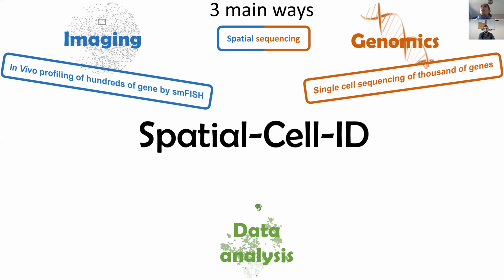And so these 3 ways are, first, using imaging. With this imaging method, you can look at hundreds to thousands of RNAs and profile them using in situ methods such as single molecule FISH or other types of single molecule FISH experiments. You can also do genomics.